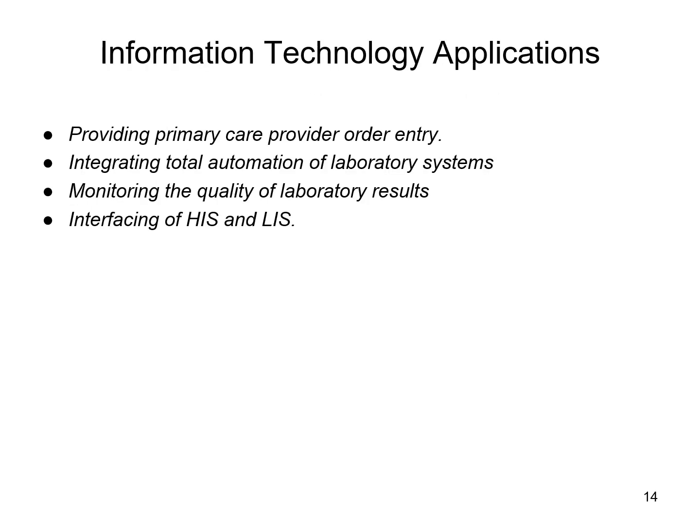Now, most of your healthcare settings now have some sort of IT personnel. Somebody's going to be involved in making sure that those computer functions, that technology, is integrated properly, that there's validations performed, that what you put in is what you get out. And what all of this does is it allows the provider to put the orders in, and then those orders can get transmitted to the laboratory somehow, some way.